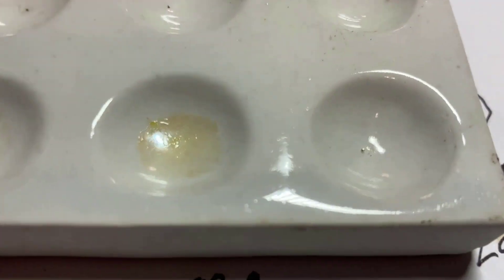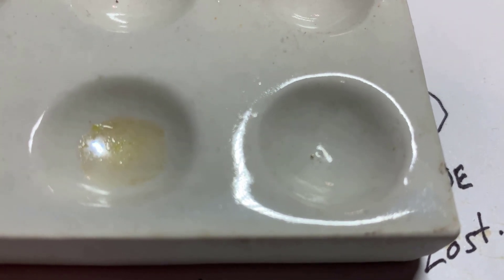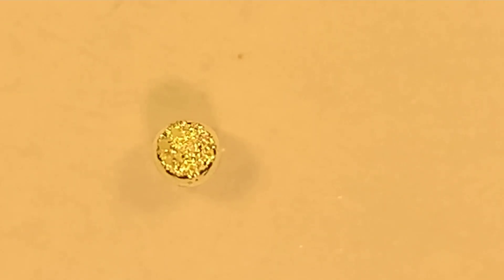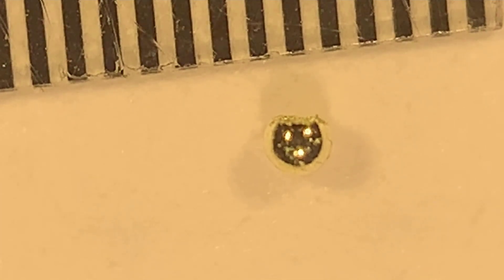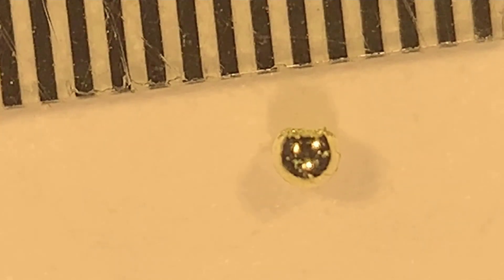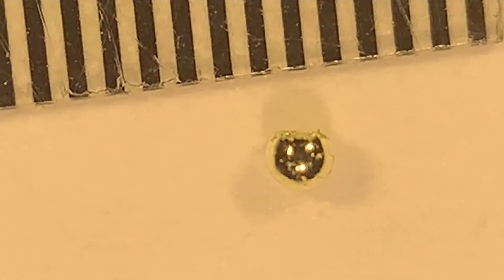I got it into the spotting plate right there. I'll add a little hydrochloric acid. There's the bottom side of the bead. There's the tiny little bead next to the scale — it's kind of embarrassingly small. You can see it's less than half a millimeter in diameter.